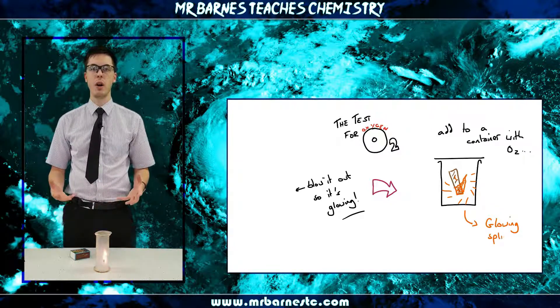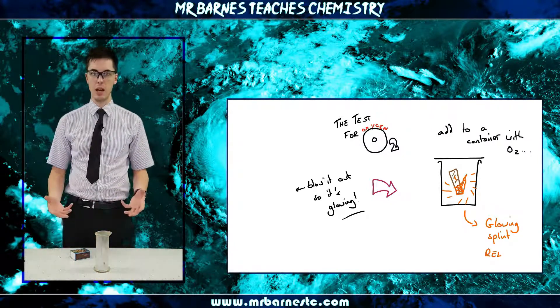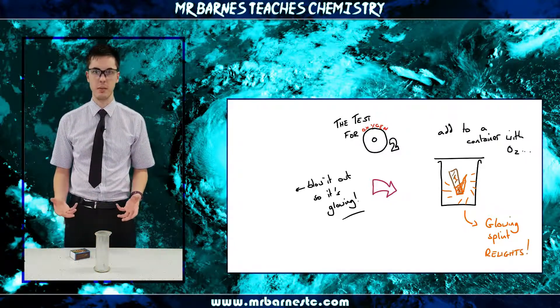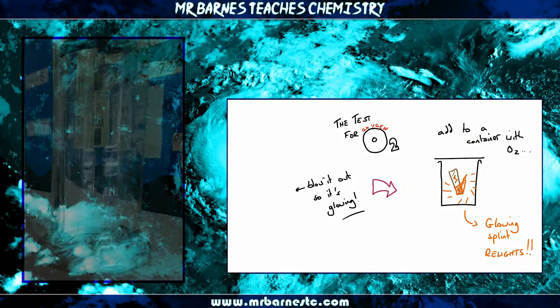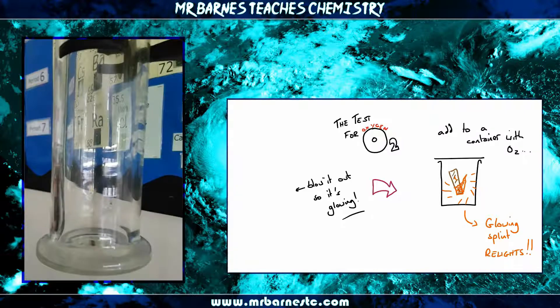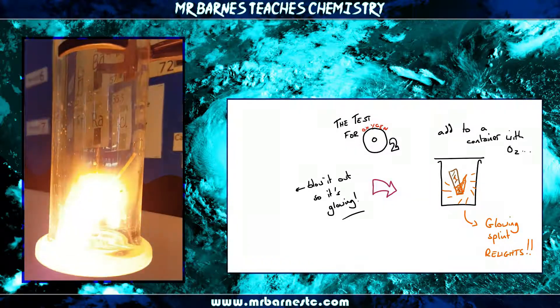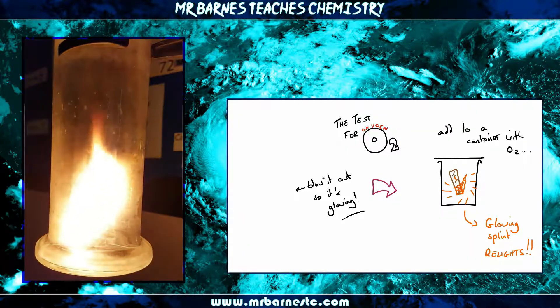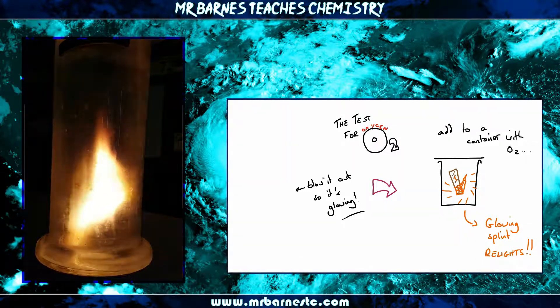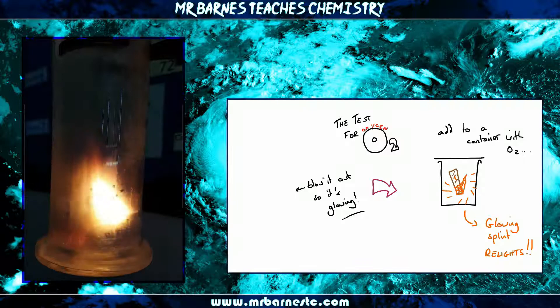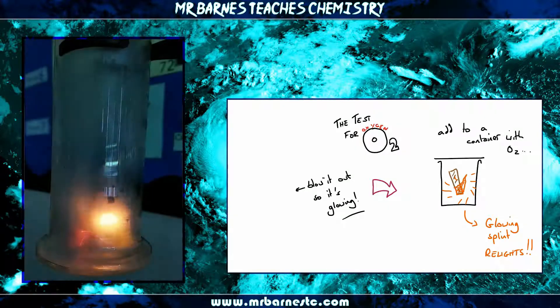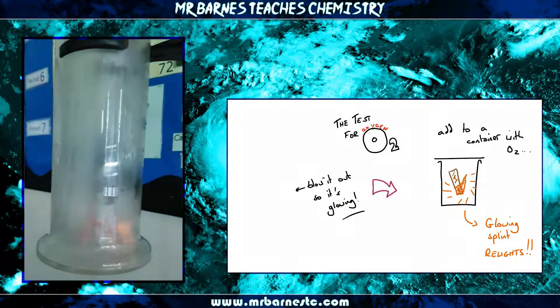So your test for oxygen is it relights the glowing splint. If I just show you a close-up version as a summary — you take your glowing splint, you add it into oxygen, and if oxygen is present it will relight, as you can see here.